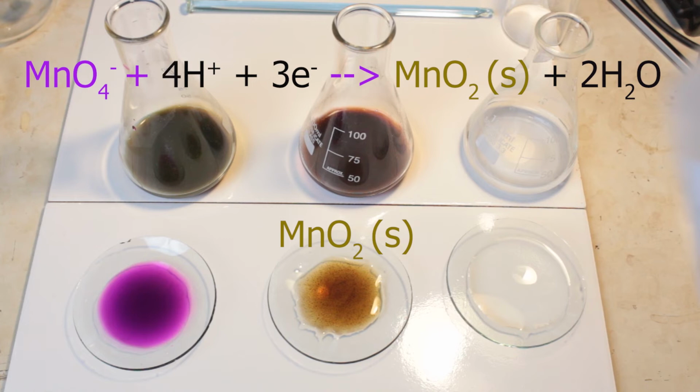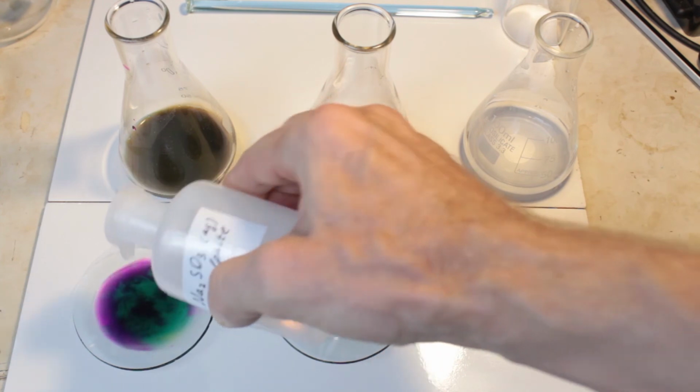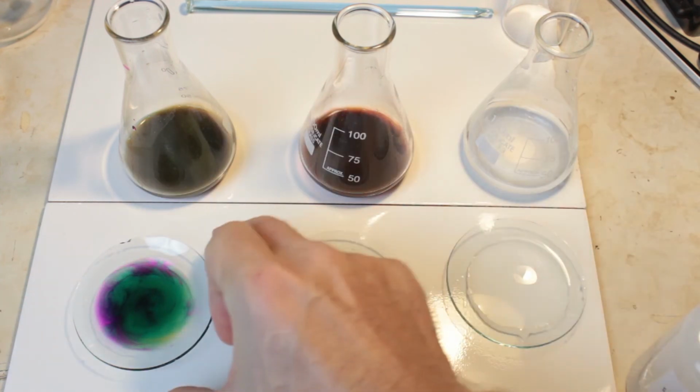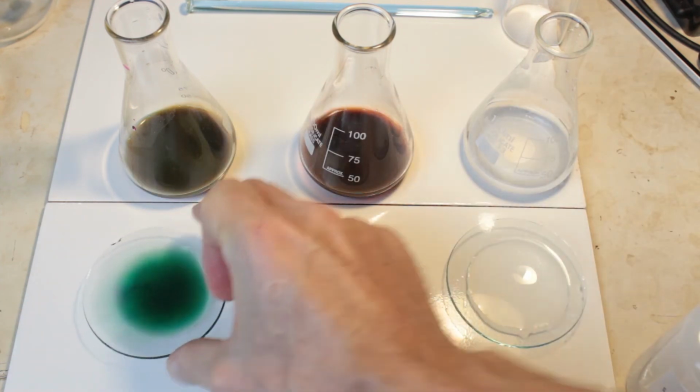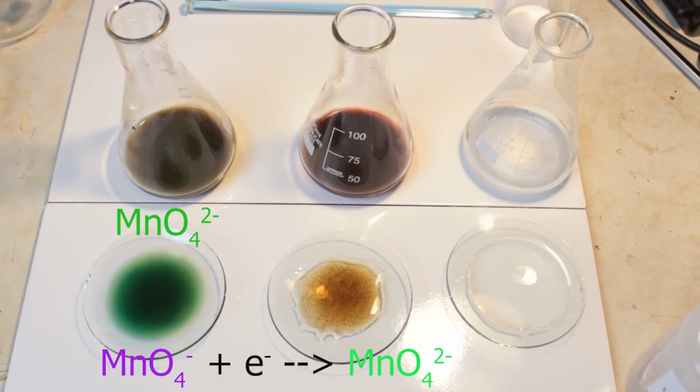Here in alkaline conditions you see, okay, very beautiful green color, and it's because of manganate 6 ions. You see, here is virtually no hydrogen ions to remove any oxides from the complex. So the only way to reduce is just give 1 more electron. So the complex with charge -1 is becoming the same complex with charge -2.